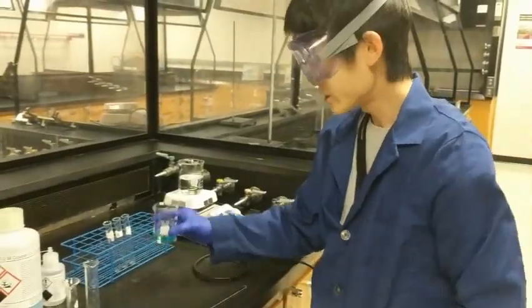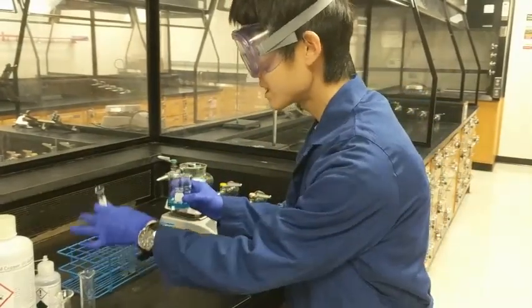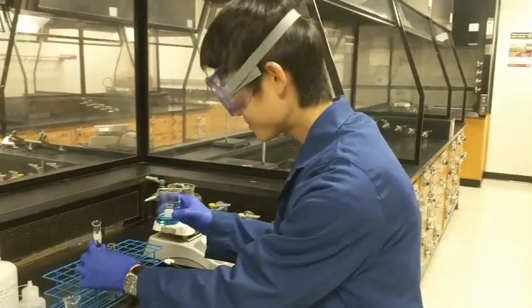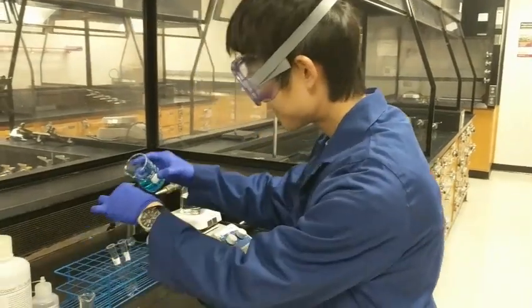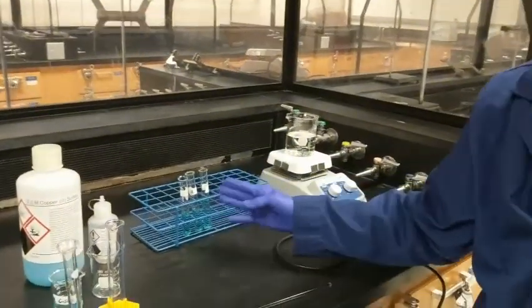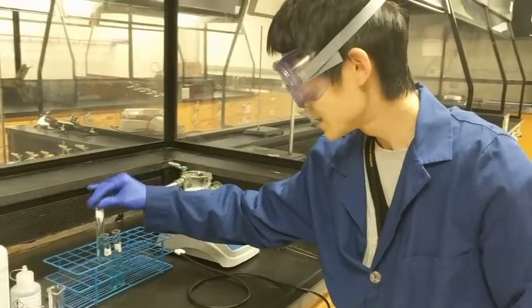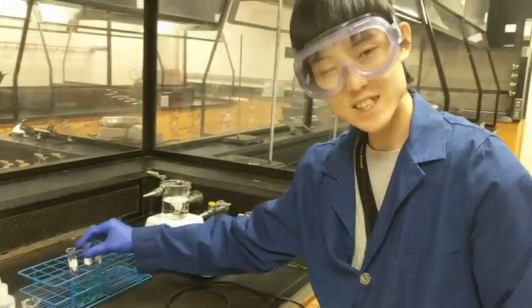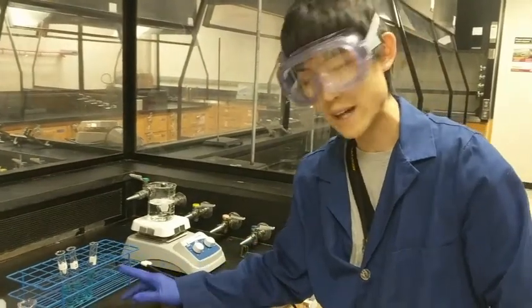So now we are going to split this solution into 3 clean glass test tubes, as equally as possible. For the first test tube, we are going to use it as a reference. For the second test tube, we are going to put it into a hot water bath.